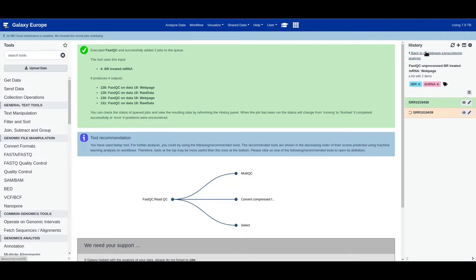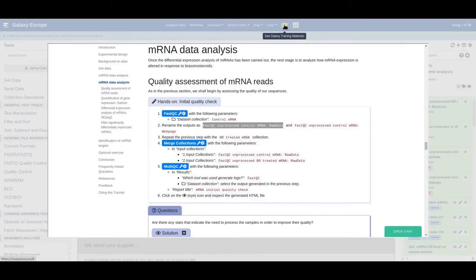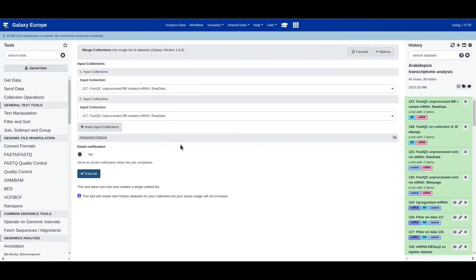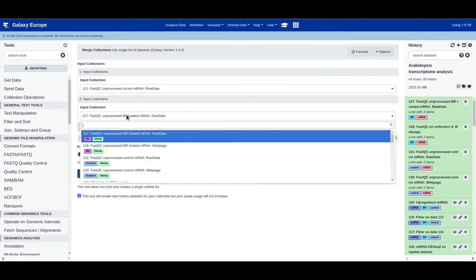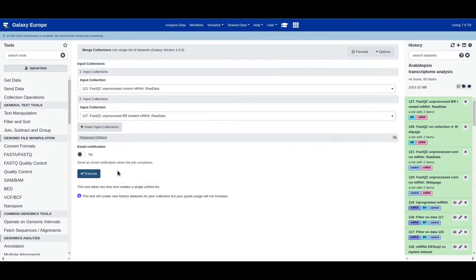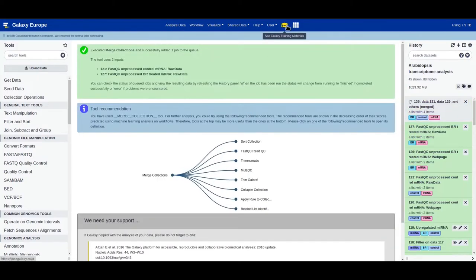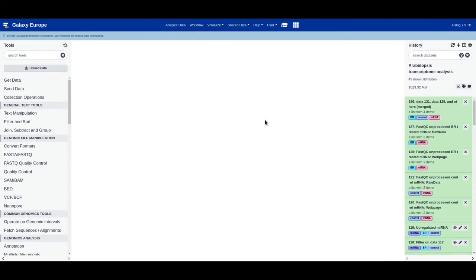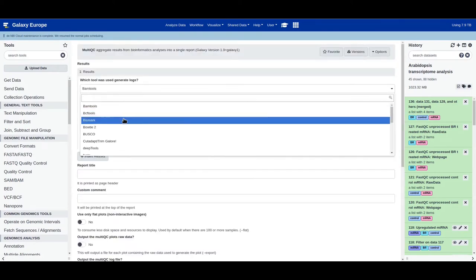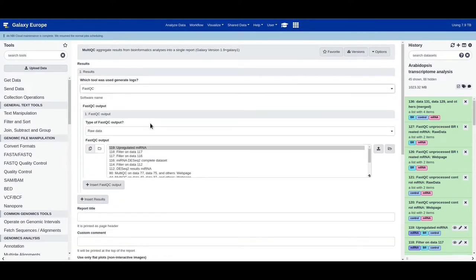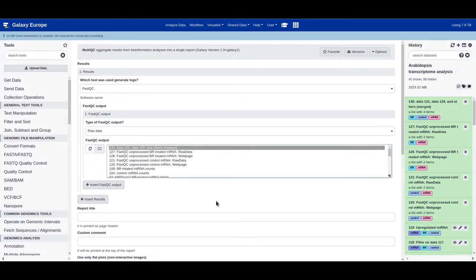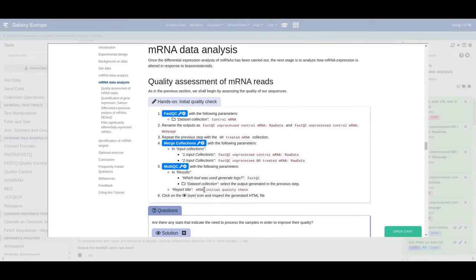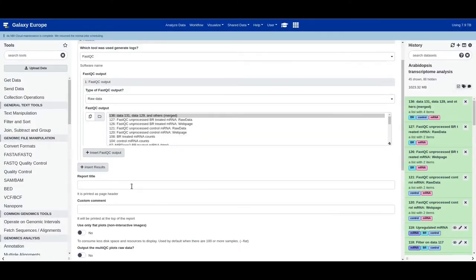Now we merge the collections of the FastQC outputs — select the raw data collection from the first run and the raw data collection from the second run, then click execute. Now we use MultiQC to summarize the FastQC results in one single report. Select FastQC, choose the data collections, select the merged collection, rename the report title to 'mRNA initial quality check', and click execute.